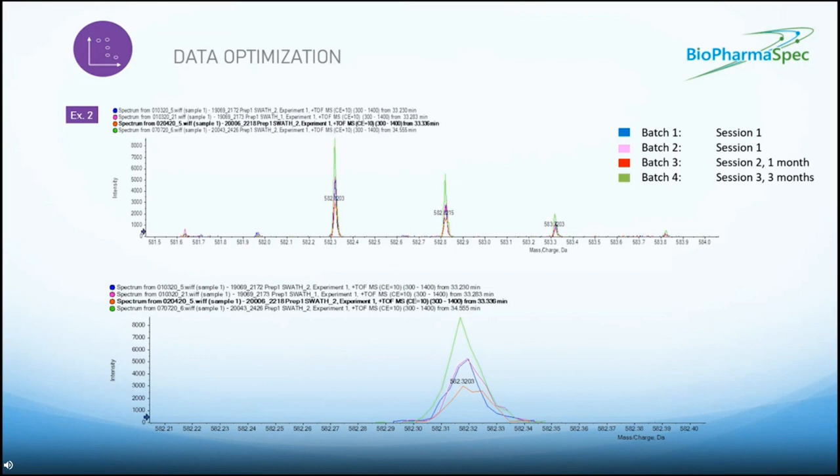The retention times and the peak areas are consistent, and the fragmentation data, which isn't shown here, was also very reproducible. So really, this is just a point about keeping an eye on your standard spikes. It's a good way to check for reproducibility, and these parameters are especially important when you're doing, for example, batch-to-batch comparisons of the same sample types for HCP levels across the course of a year or whatever the time period is.